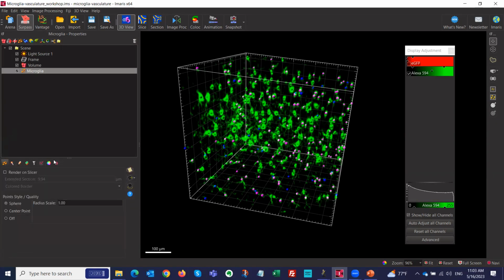So we have a lot of tabs here. I do want to go briefly through all those tabs to finish up the spots. And then we can do the surface after lunch break. The surface builds up on the spots, so I don't have to re-explain everything because we already saw a lot of things with the spot. I'm just going to point out the difference about the surfaces.